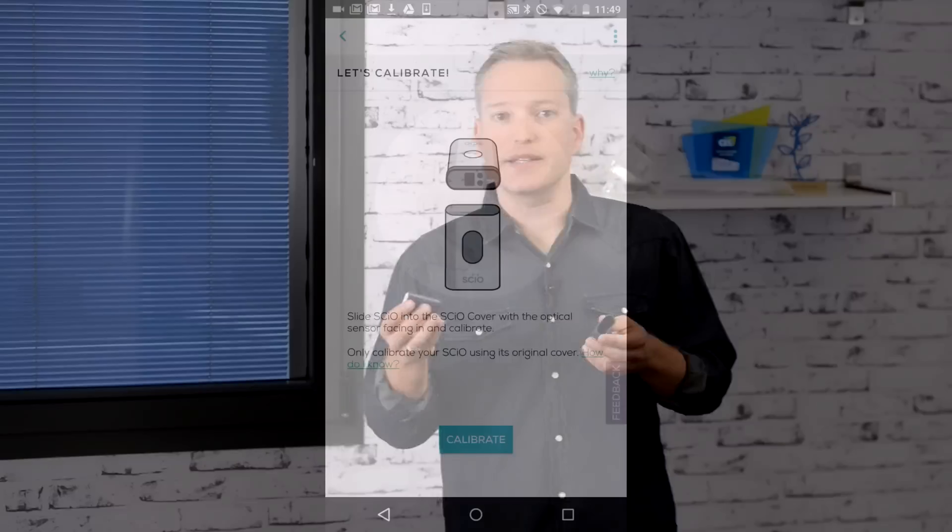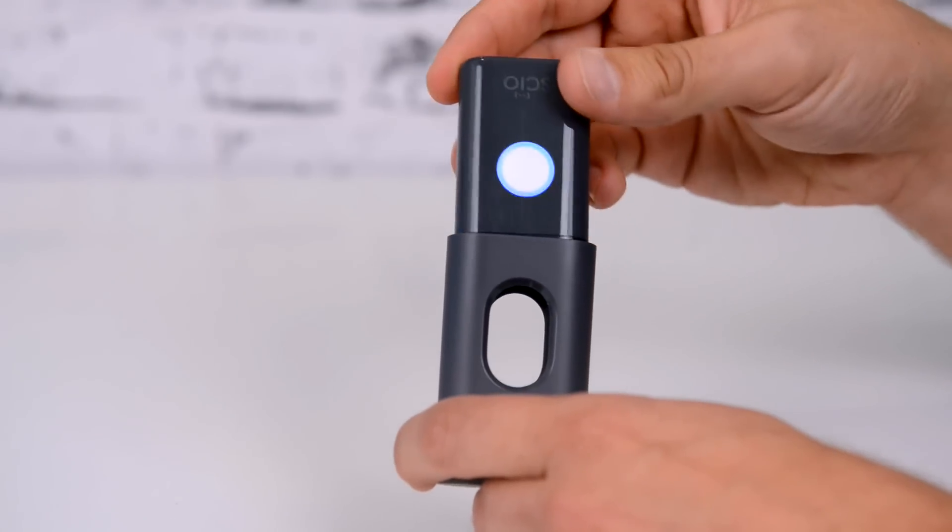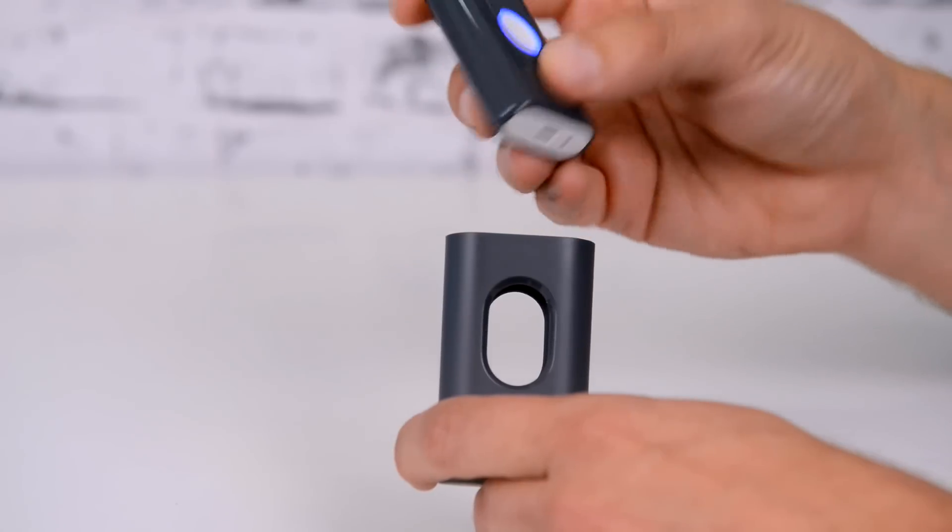Sayo also has to be calibrated occasionally. It will automatically identify when calibration is needed and prompt you to do so — the LED light will also turn yellow and start blinking. The calibration device is located inside the Sayo cover. So when prompted, simply place Sayo in its cover with the optical head facing in. Tap calibrate or click the function button to calibrate. Once calibrated, don't forget to turn Sayo with the optical head facing out.